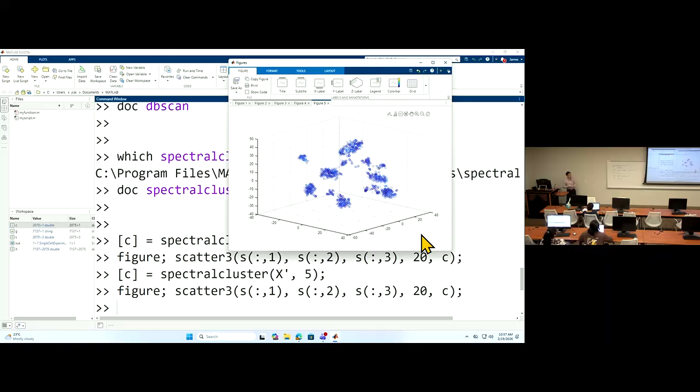So eventually we compared this. In the toolbox, we choose to apply it directly to t-SNE embedded cells. That's what we are going to do.